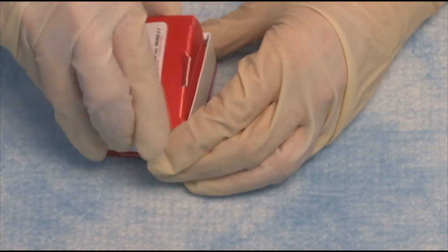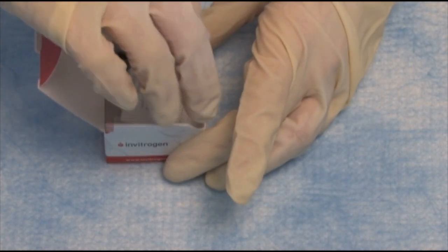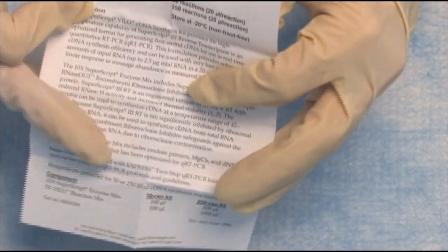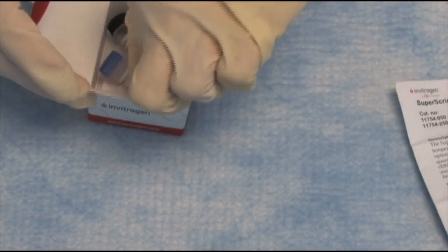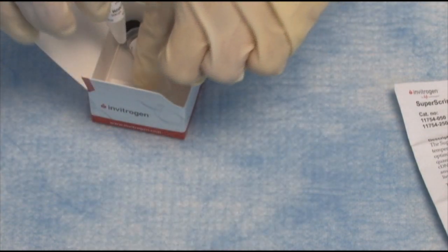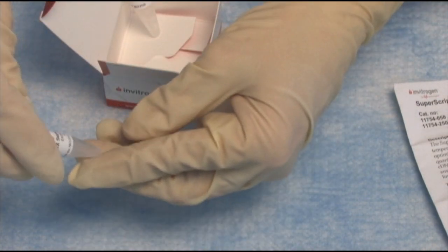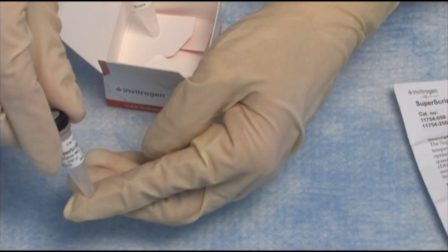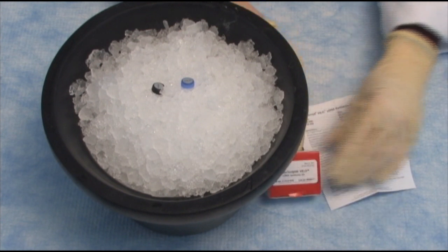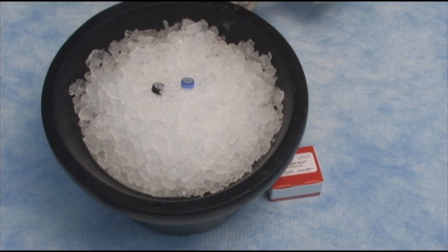Let's open it up. First of all, we have our nice little insert that tells us everything we need to know about the kit. There are just two tubes in here: one is the 5X Velo reaction mix, and two is the 10X Superscript enzyme mix. I'll put both of these on ice. This kit includes SuperScript 3 RT, the RNaseOUT recombinant ribonuclease inhibitor, and a proprietary helper protein.